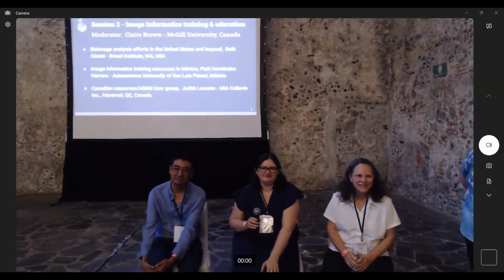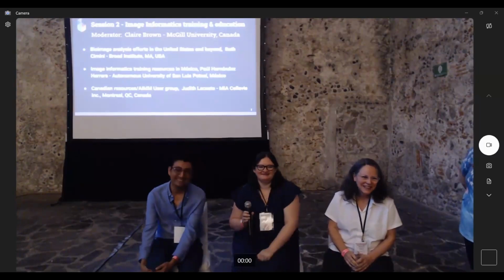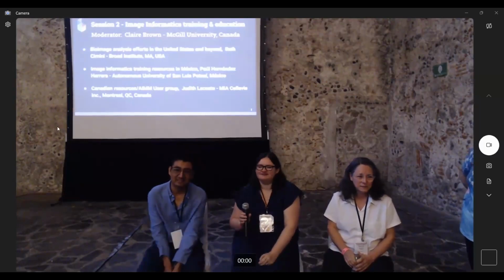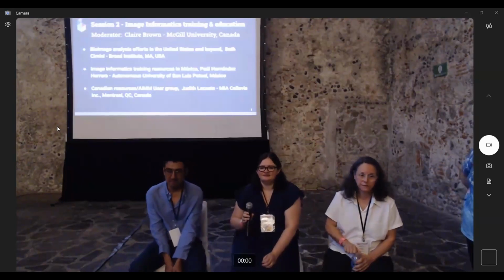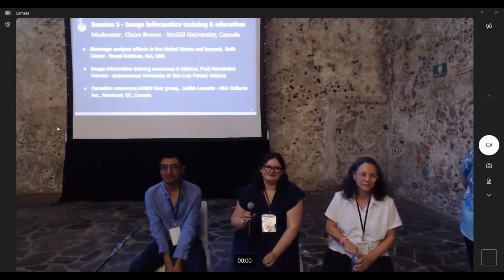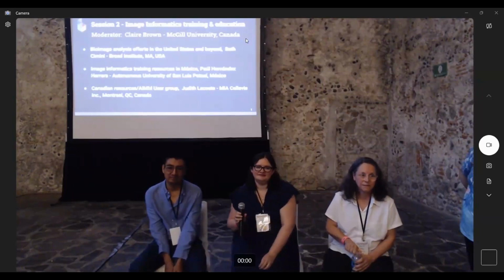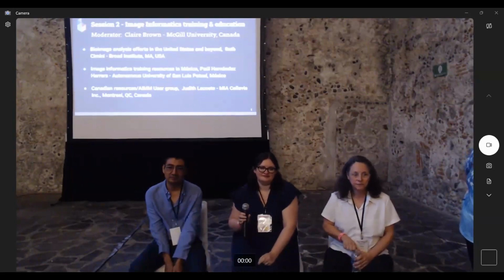Hi, great presentations, everyone. I'm going to ask a question to make things a little more complicated. I would love for all of our analysis pipelines to be integrated into something like Omero. It's a beautiful piece of software. But my analysis is not a script. My analysis is a very complex workflow where maybe I've gone into CellProfiler, maybe I've done some sort of nightmarish Jupyter Lab where I pulled in a neural net and done some complicated segmentation like Paul's describing. How do you anticipate Omero interfacing with all of these increasingly complex AI models, multiple pieces of software playing together? How can you bundle that up and make it actually reproducible?